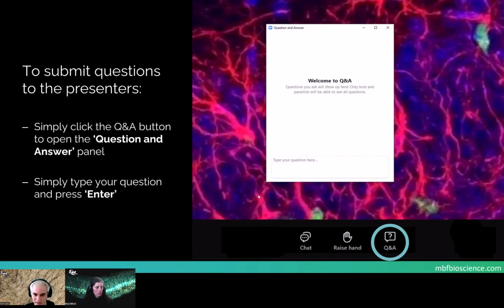There's one question about the type of image files. Should I bring 3D image files? Is stack image file support not available? No, if you provide us with your whole region of interest in a Z stack, like a 3D virtual section of your region of interest, that's fine. Then we will just subsample.